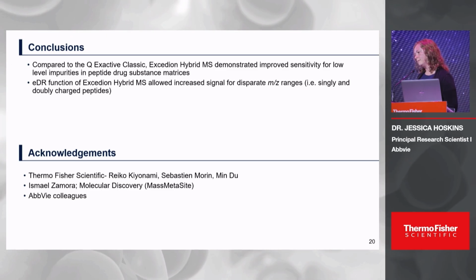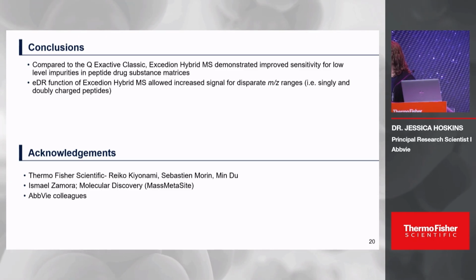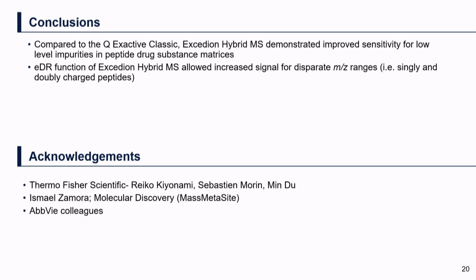Hi, thank you for the very interesting talk. I have a question about the EDR. Have you seen if the cycle time has any impact, especially if you're doing a chromatographic-based run, because of the switching back and forth? Do you see any changes in the cycle time?